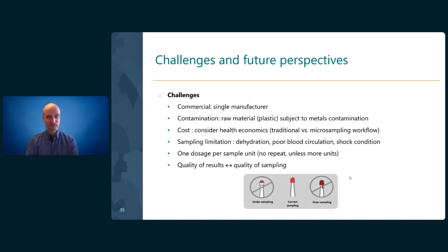A full exercise has to be done that considers the health economics related to the workflow. The sampling limitation is also challenging. This approach might apply to most patients, but in some cases it becomes limited, for example, when a patient suffers from dehydration, poor blood circulation, or shock condition.